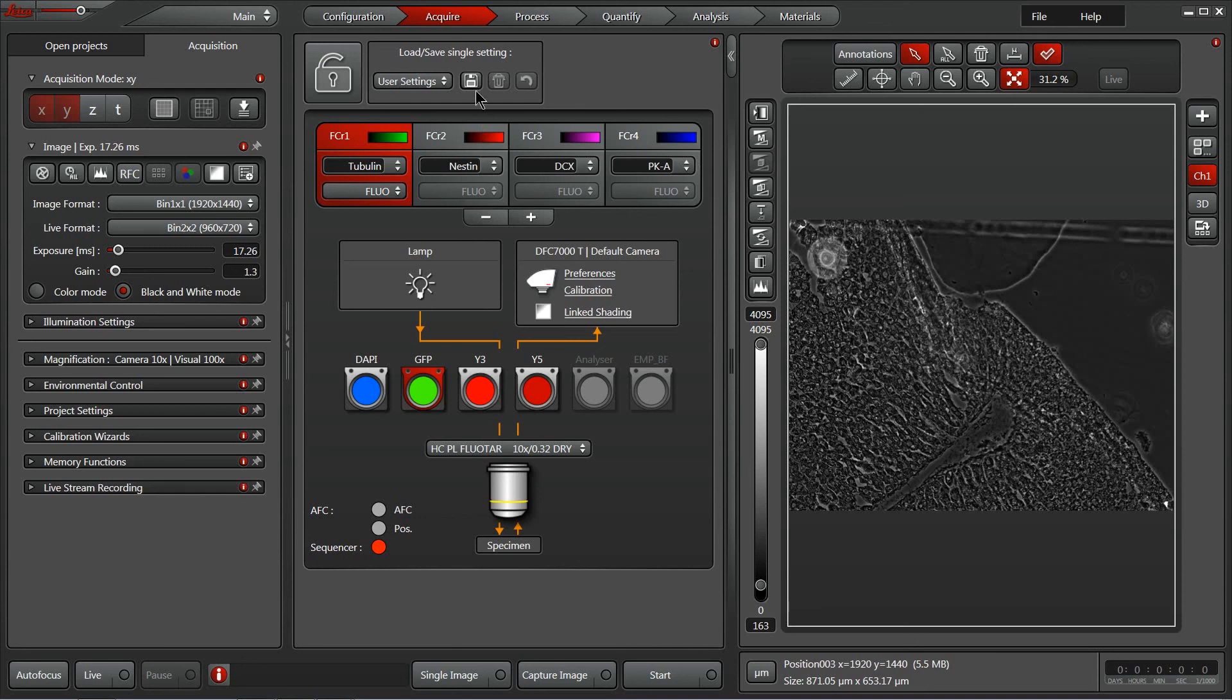Once you have all of these set, it's very easy to save them. So you can save these current settings and quickly pull them back up. The next day you sit down with the same sample and have a much faster starting point.